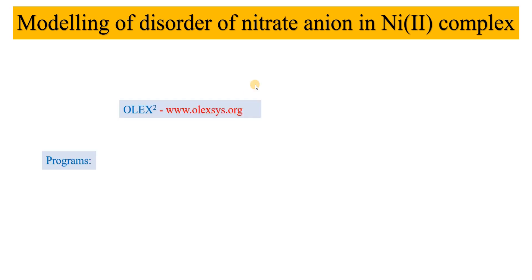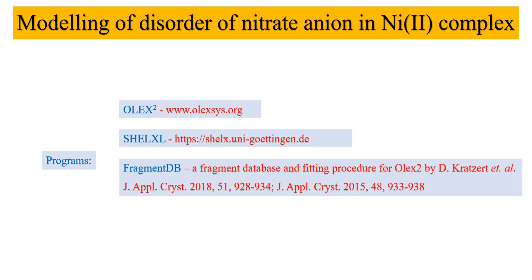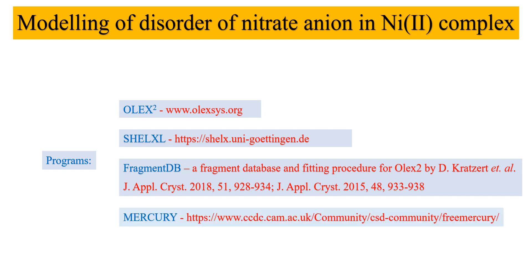Hello everyone, welcome to this video tutorial on modeling of disorder of the nitrate anion in a nickel 2+ complex. The crystallographic programs used are Olex2, SHELXL, FragmentDB — a fragment database and fitting procedure for Olex2 — and Mercury. All these programs are available free of charge for academic users. So let's start with the refinement part.